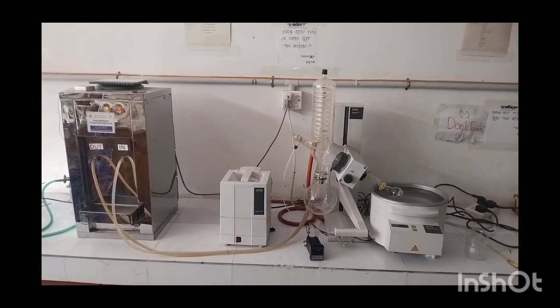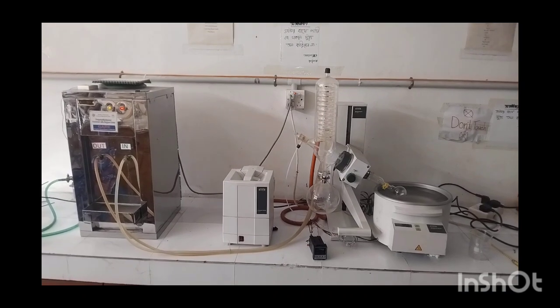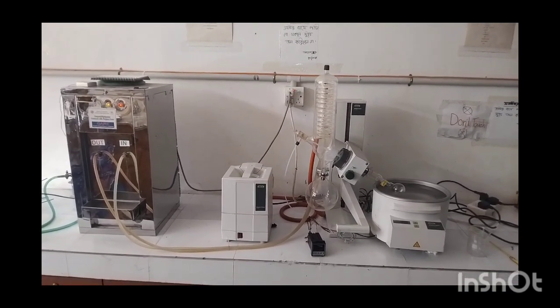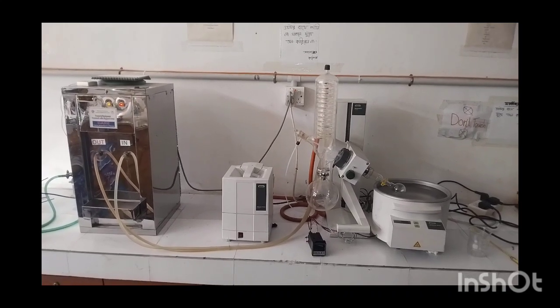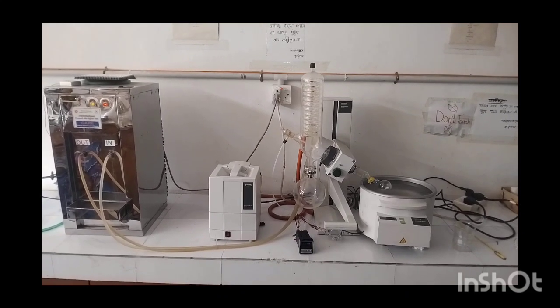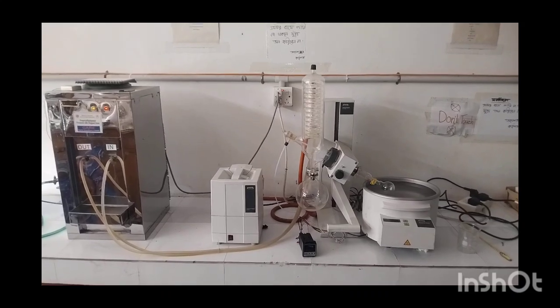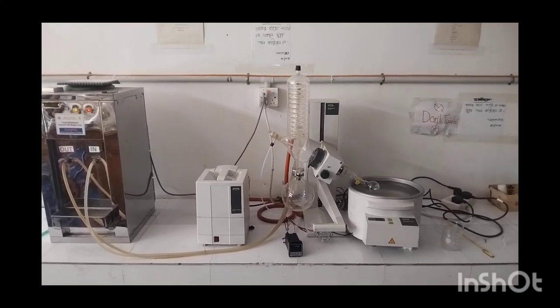When we would like to complete a reaction using a round bottle or RB bottle, then obviously in this specific RB bottle there will be a starting material, acylating agent or different kinds of agents, and after completing a reaction it will create a product. And when you'd like to get the product, then obviously you have to get rid of different kinds of solvents. So that's why we would like to use this specific Rotavapor.